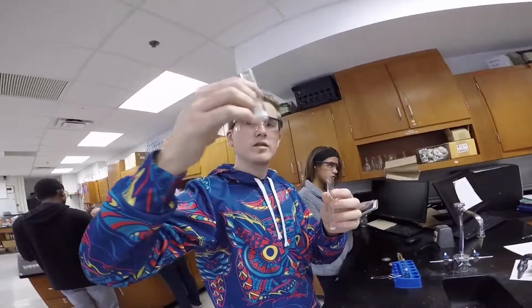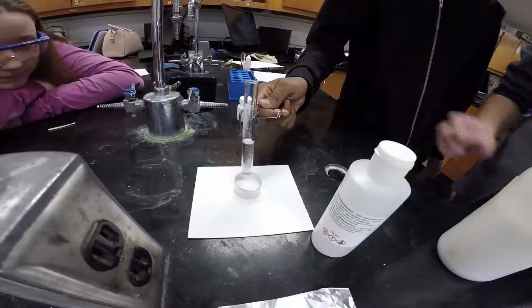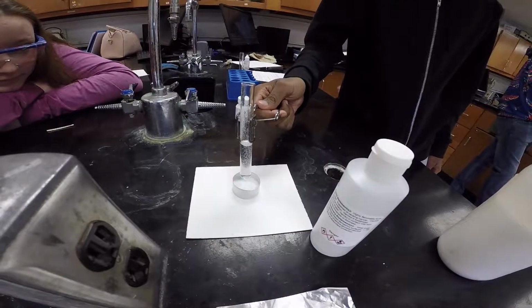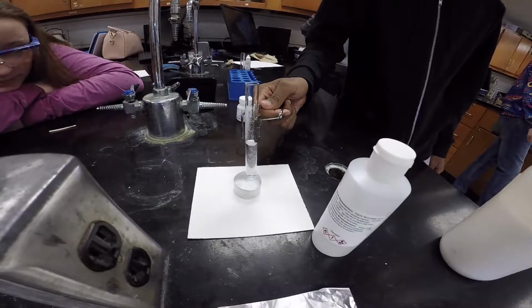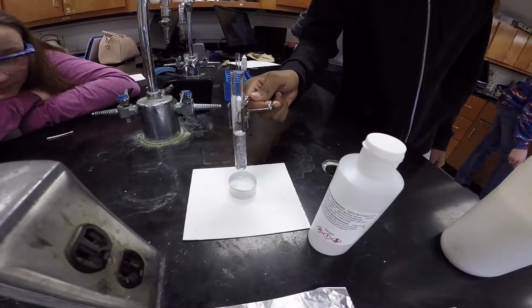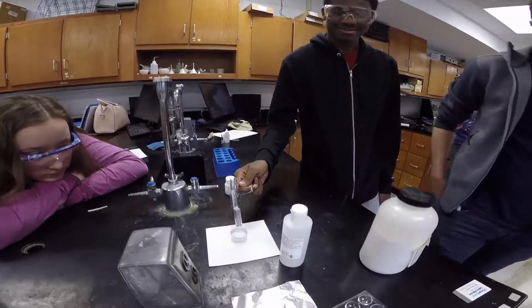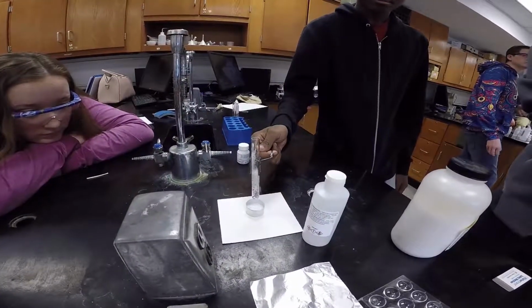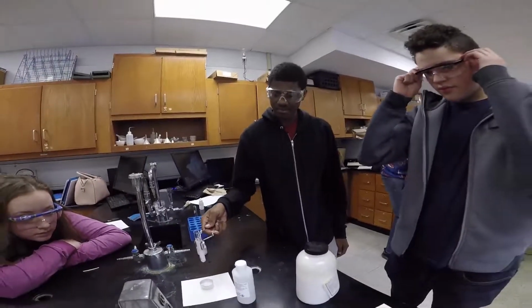It all got stuck right there. I would use a little distilled water. It's all solid, liquid, bubbles. I'm done making one inside. Don't let it boil over.